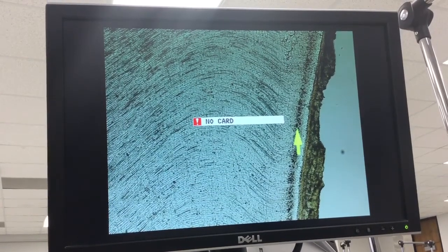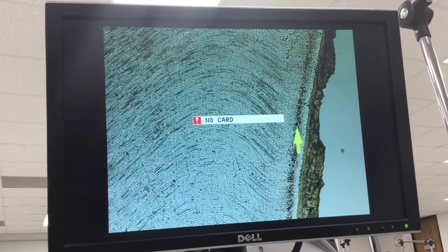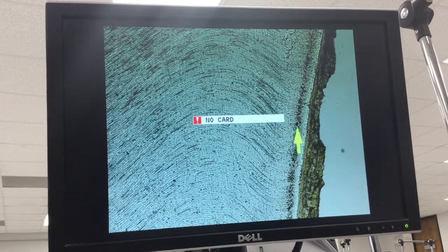Put them on the bridge of your nose and stand back about 3 feet, right on the line of the tiles, and look right in the middle of the two stereo pairs. We have one above the other, or one below the other, whichever you prefer. And take a look at that. And as you look at it, you may have to back up a little bit, get a little bit forward. You taller people are going to have to probably squat down a little bit because I put these up.